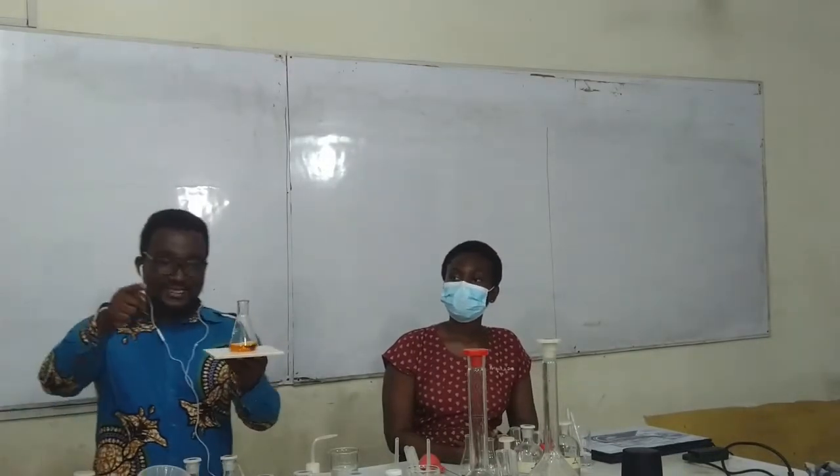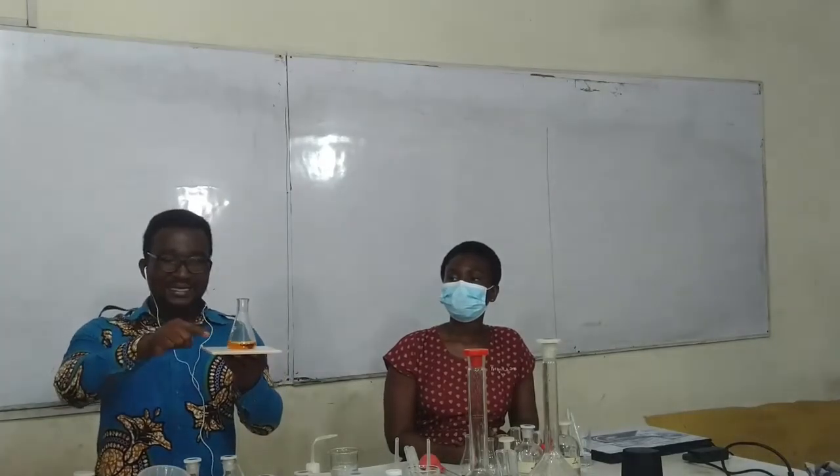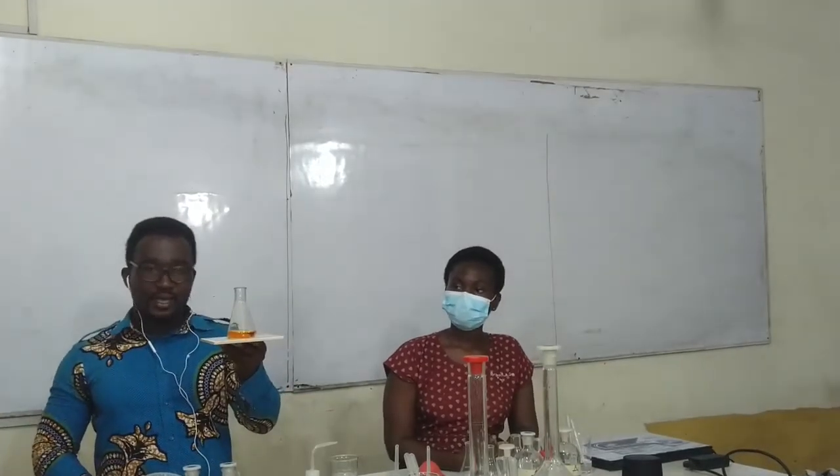And the white tile is giving us the specific color, otherwise you may be deceived. So you can guess what color this is. If your guess is that the color in here is yellow, then your guess is right. You are correct. As I told you earlier, you explain the theory behind it.